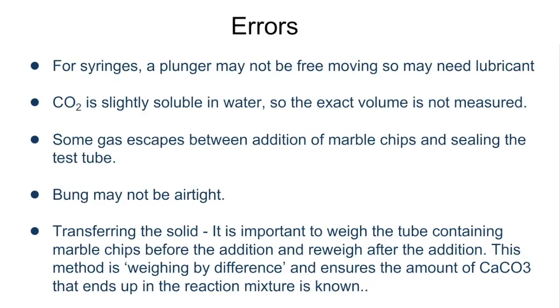However, with any practical, we can always expect errors. For our syringe, we need to make sure that it's free moving. If not, we do need to use a lubricant so that we can get our gas pushing the syringe to give us our final volume. One major problem with this reaction, if we do the collection over water, is the fact that CO2 is slightly soluble in water. So our exact volume may be slightly off. So you probably find that you're going to want to do this reaction with a gas syringe just to avoid that.